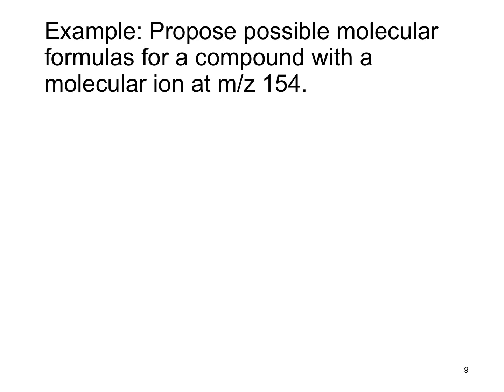So the first thing that I do is I'm going to assume this guy either has carbon and hydrogen or carbon, hydrogen, and oxygen. Okay, those are my two assumptions because it's an even number. And so I am going to figure out kind of the max number of carbon atoms this guy can have.